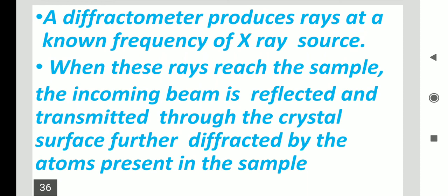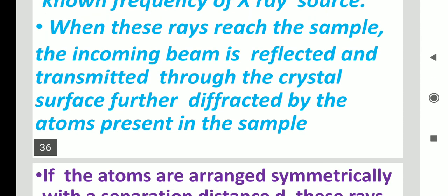These rays are incident on the powder sample; few are transmitted, few are reflected, and further the rays are diffracted by the atoms present in the sample.